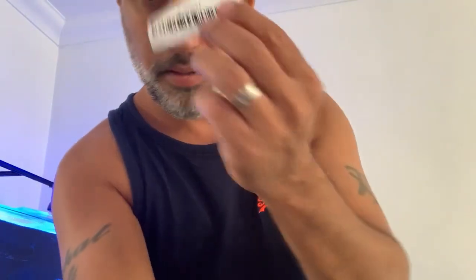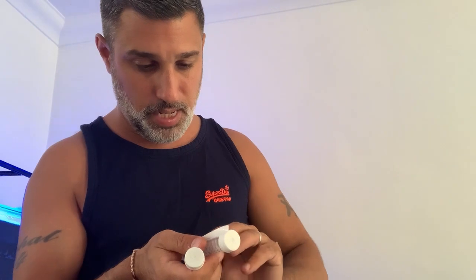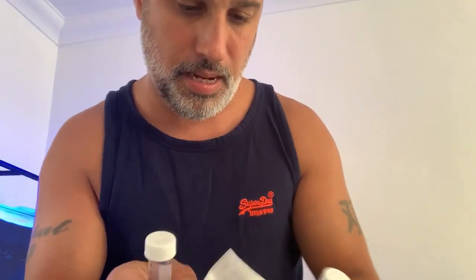So we've got the two EndOC test vials ready. Now I need to get the barcodes — there's one barcode for that vial and another barcode for this one.